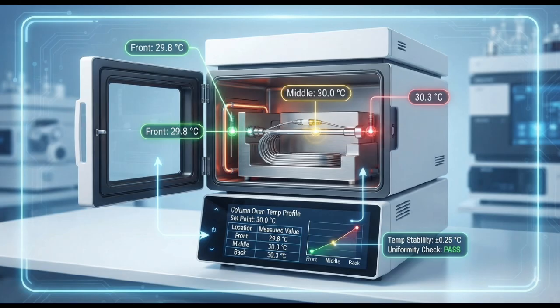Column oven temperature. Next is the column oven temperature accuracy. Temperature can influence retention, selectivity, viscosity, and chromatographic performance. The column oven is set to a specified temperature, allowed to equilibrate, and the actual temperature is measured using an appropriate calibrated temperature measuring device. The measured value is compared against the approved acceptance criteria. For example, if the set temperature is 30 degrees Celsius and the measured temperature is 30.2 degrees Celsius, the result is assessed against the applicable tolerance.